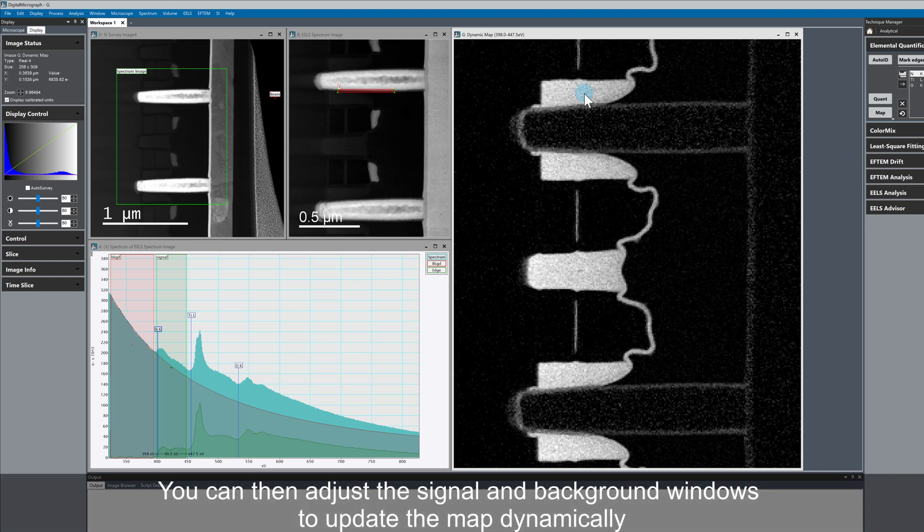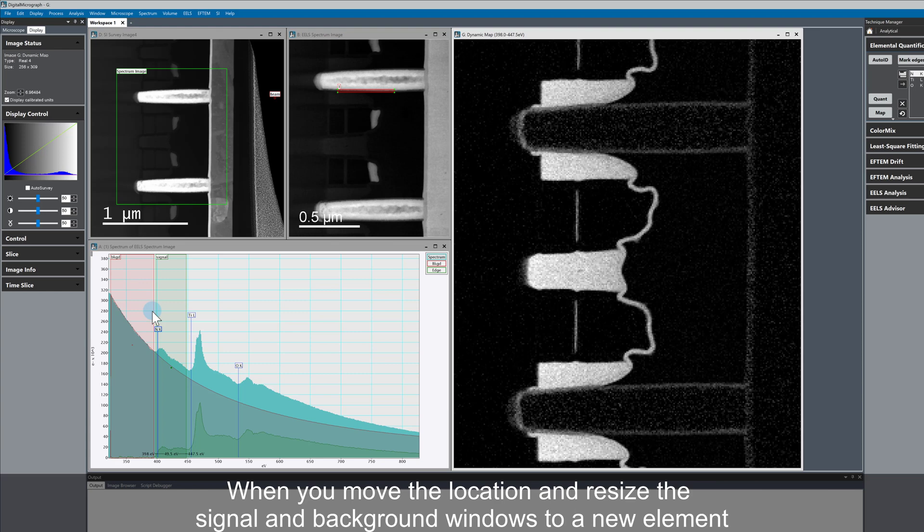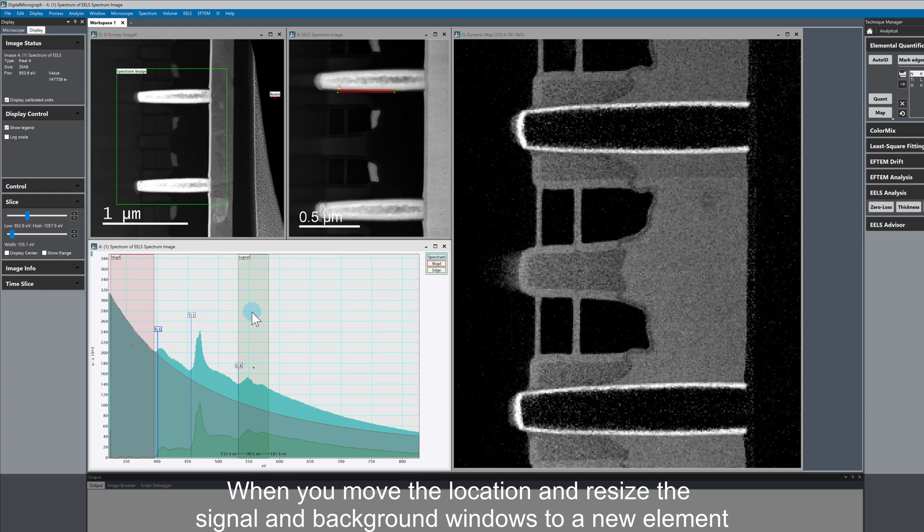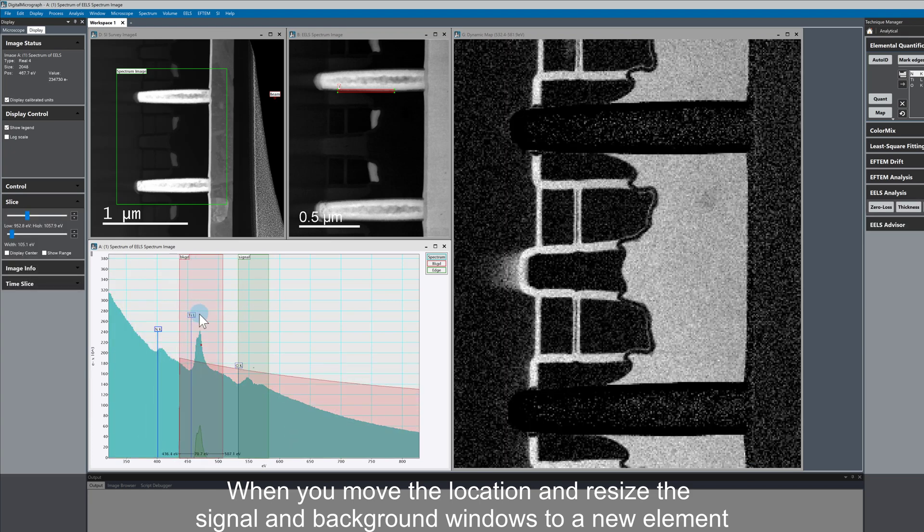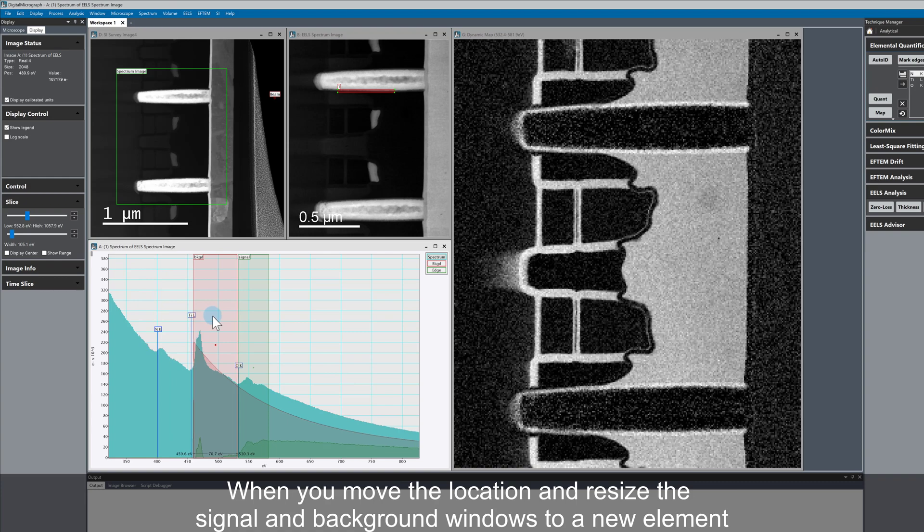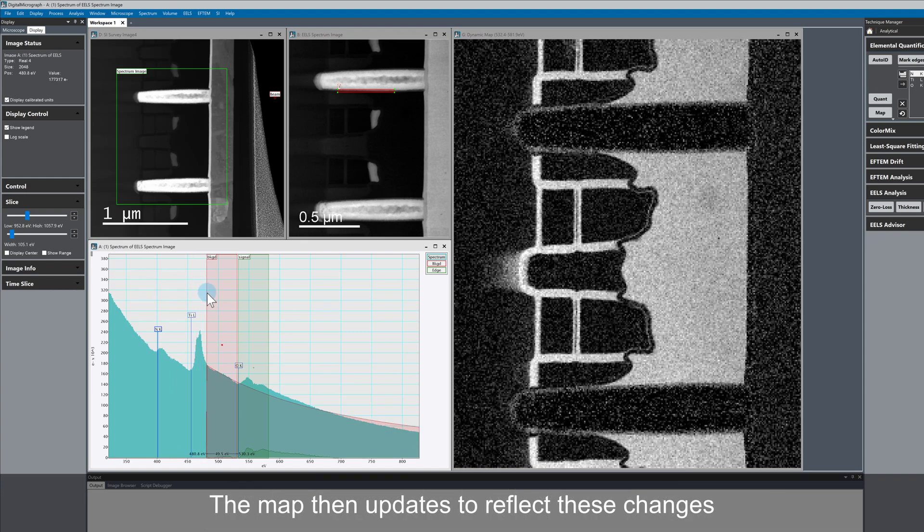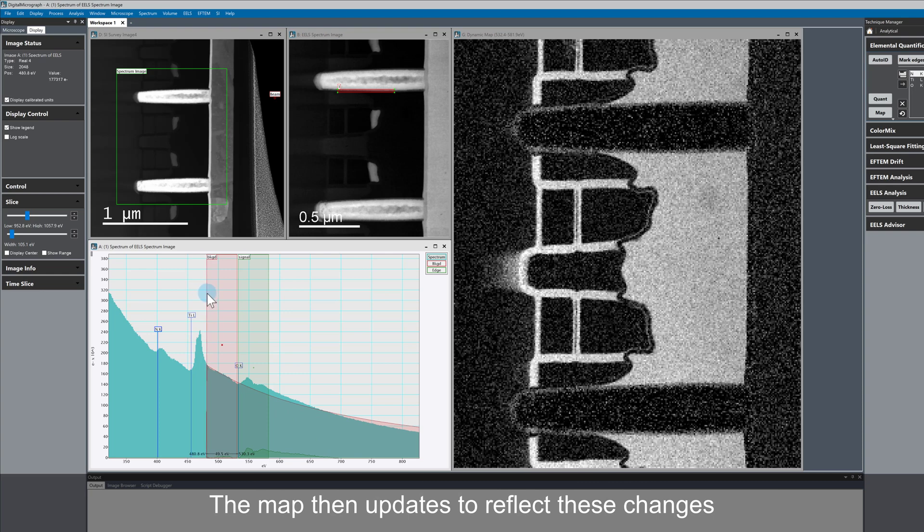What's really useful about the dynamic map tool is that we can make changes to the size and positions of these windows, and this map gets redrawn. I'm going to move the signal window over to oxygen, change the background position and size so that it's good for oxygen. You can see that the map has now changed and we have an oxygen map.